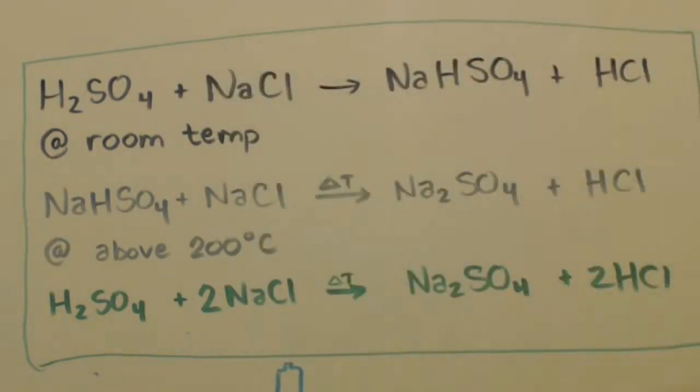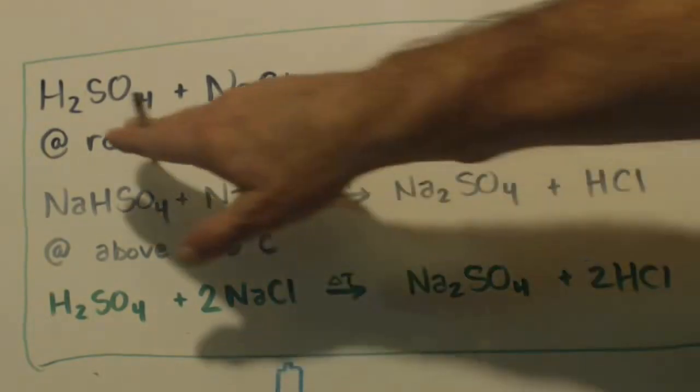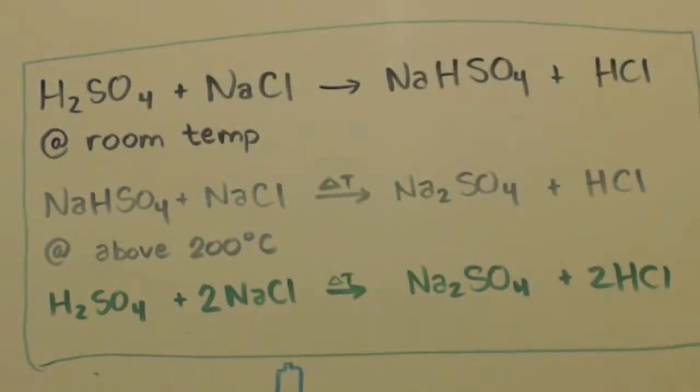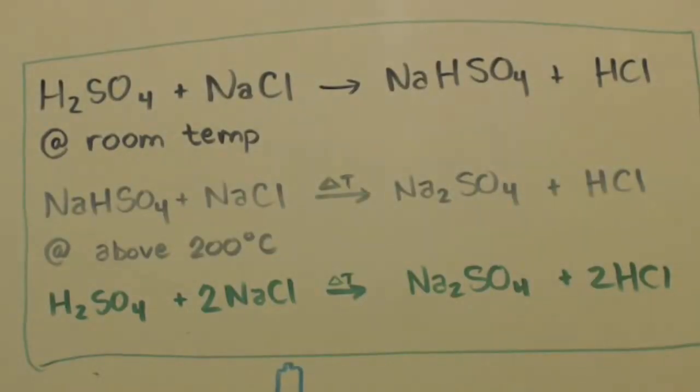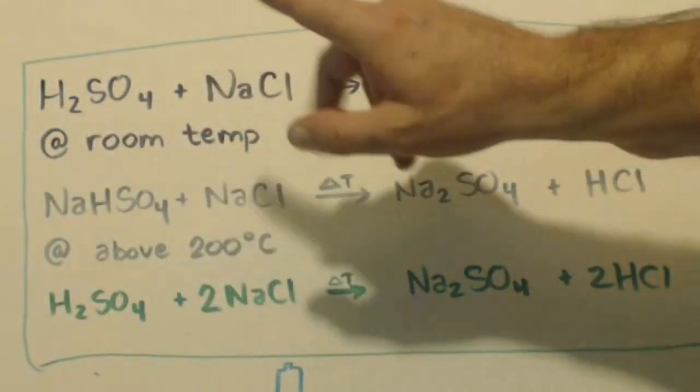We need two things. Here's the equation: sulfuric acid and most, or probably any, chloride. I don't want to get any crazy salts though. Sodium chloride's the easiest one to get. I'm not purifying anything. I'm just using drain cleaner and table salt.